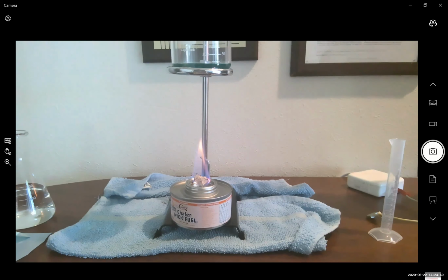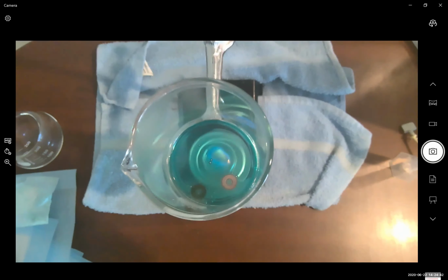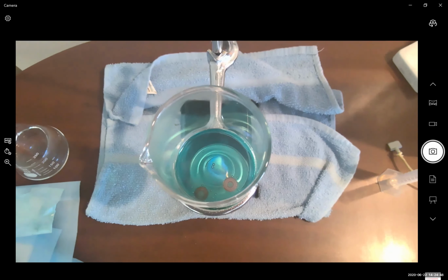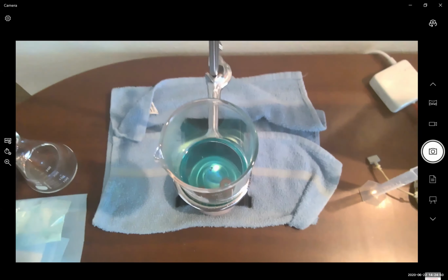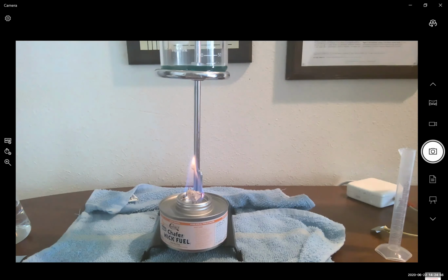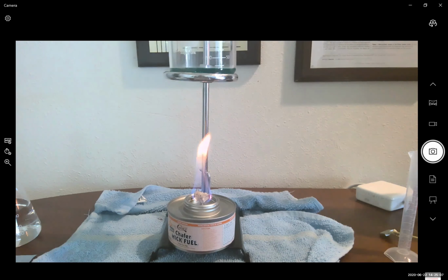So just to check in on our experiment, as you can see now, both of our aluminum washers have a substantial brown hue as a result of the generation of copper solid. You may notice the solution is also turning less green. The copper ions are the principal source of the green color in this experiment. And as a result, as the copper ions react, the solution will become less and less colored and will slowly turn colorless once the copper has completely reacted.